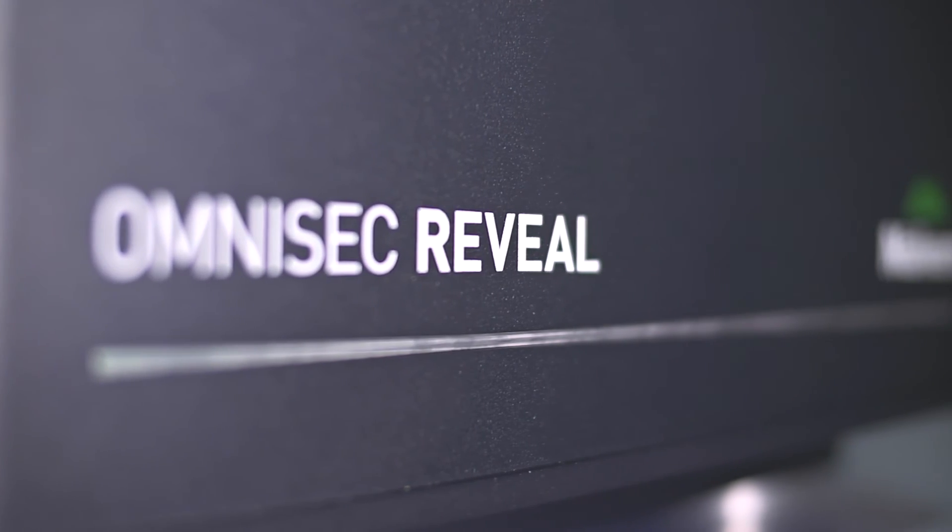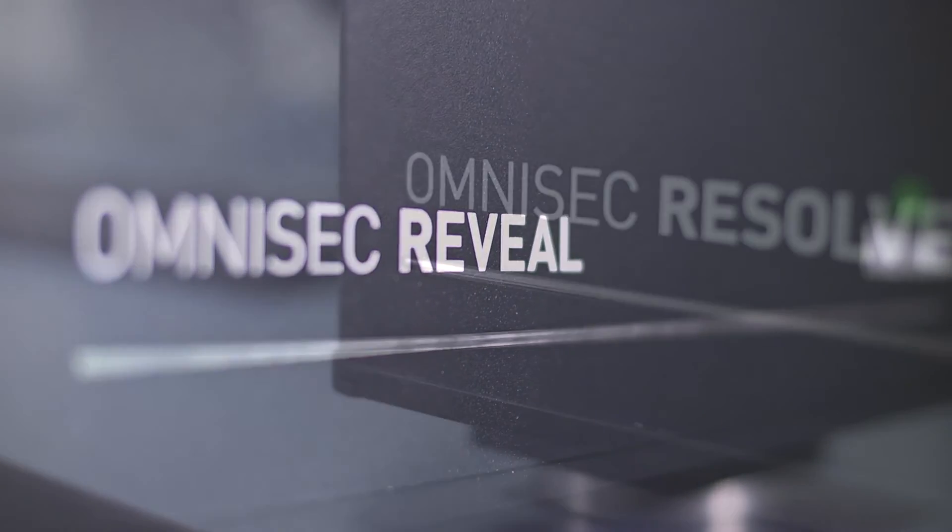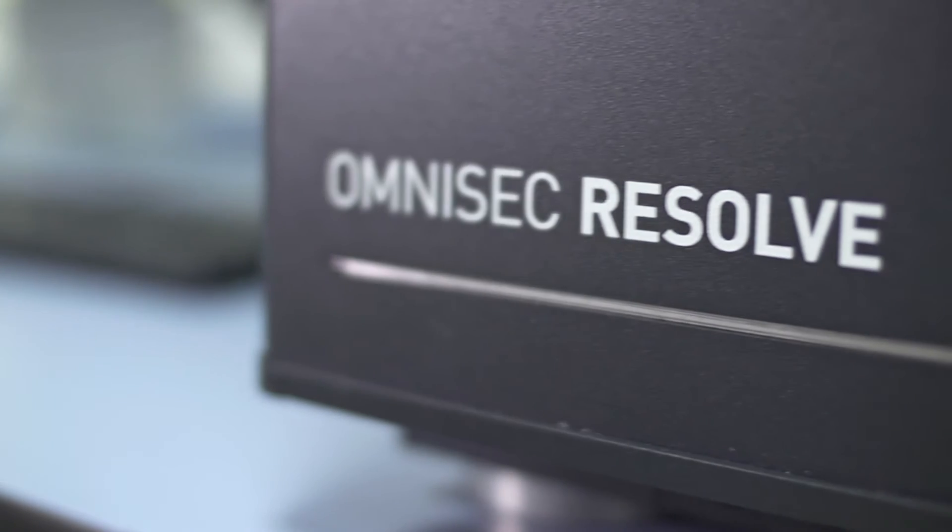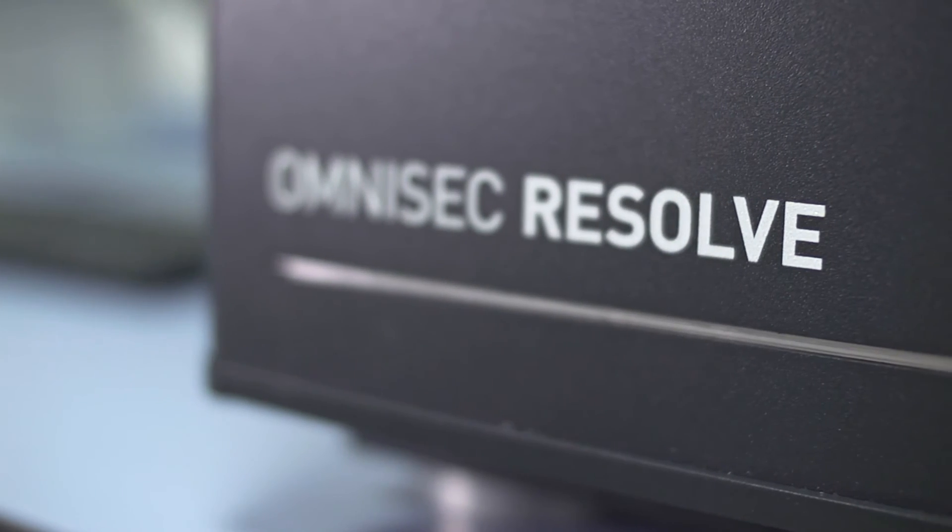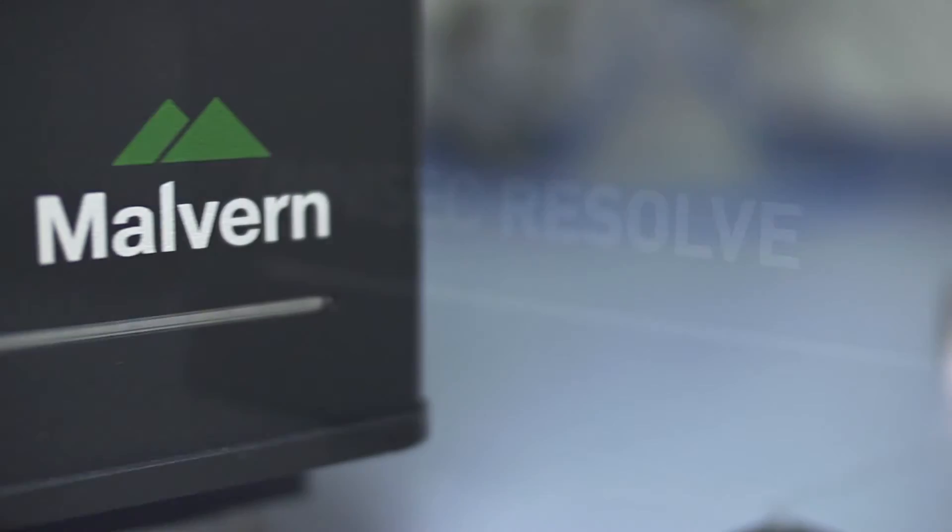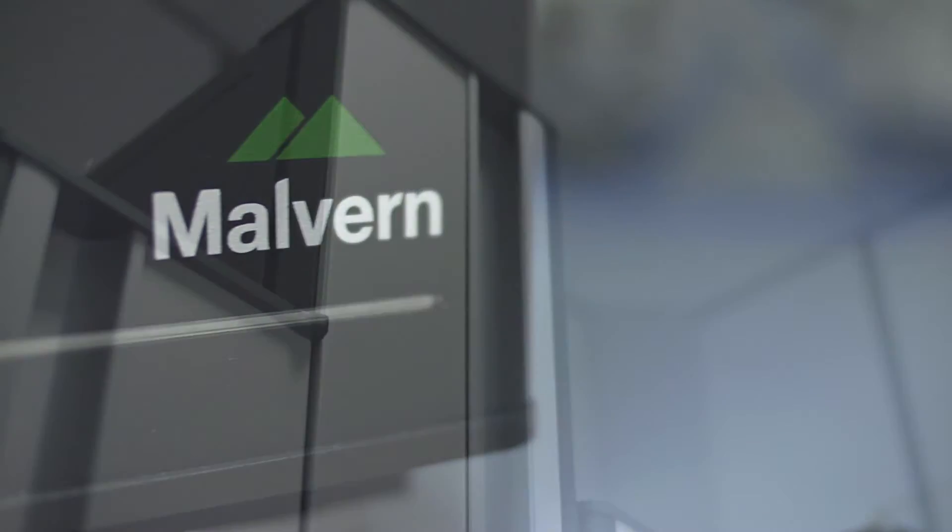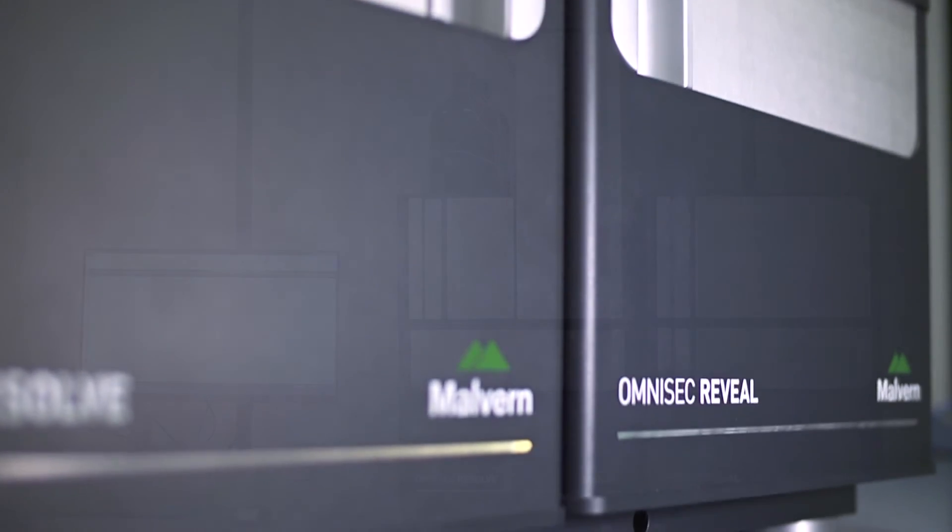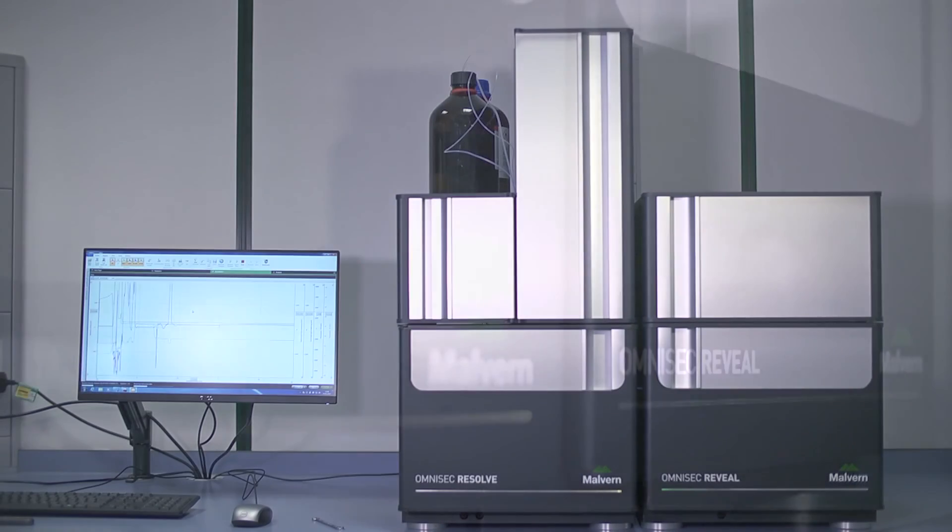Omnisec offers truly superior GPC performance for the analysis of polymers. With it, you can measure molecular weight, size, structure and other parameters to realize the full potential of your polymer development.